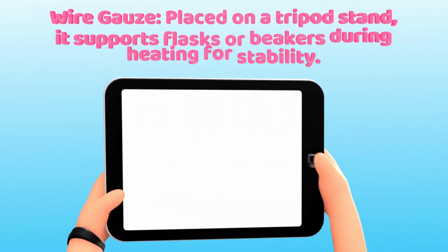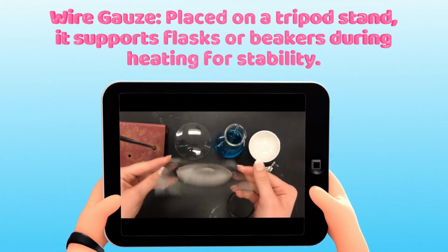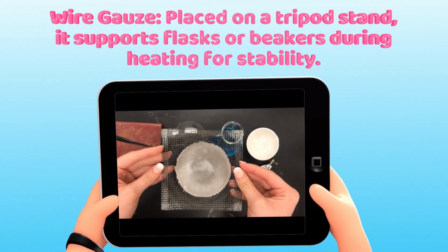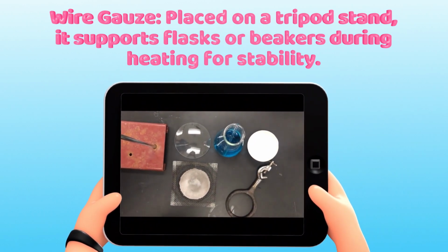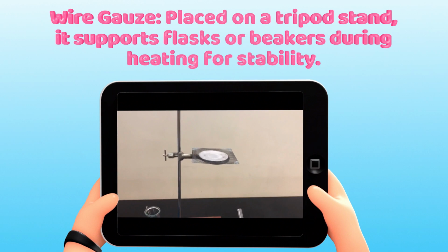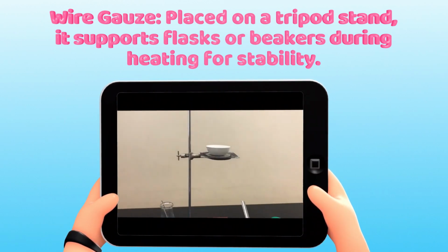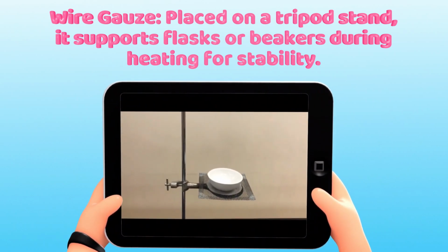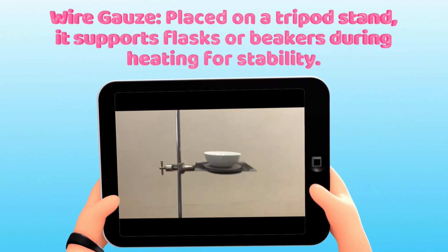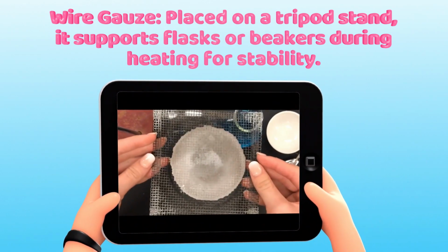Another apparatus is the wire gauze. The wire gauze is usually placed on a tripod stand. It is used for supporting flasks or beakers during heating, providing stability. So that is the main function, as you can see from the screen.